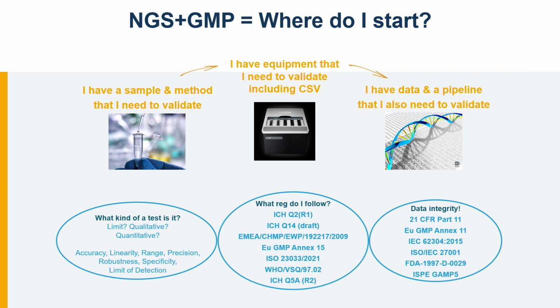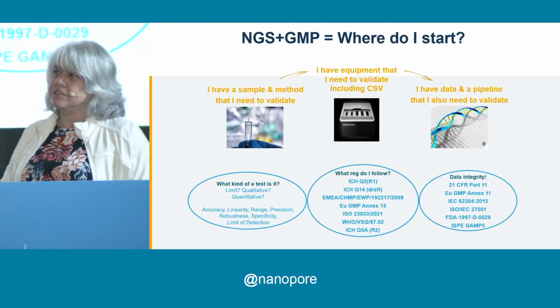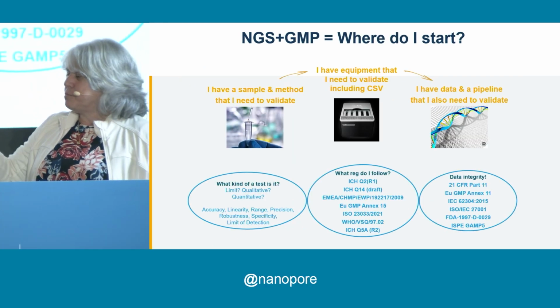Sequencing has always been a world like that, where you have to mitigate changing chemistries, evolving equipment. Oh, there's a software upgrade, just do it. No, I can't. I have to do change control, and I have to then document what the revision history is, and I need to know, and I have to test against the new features. It's not just, oh, I just press the button.